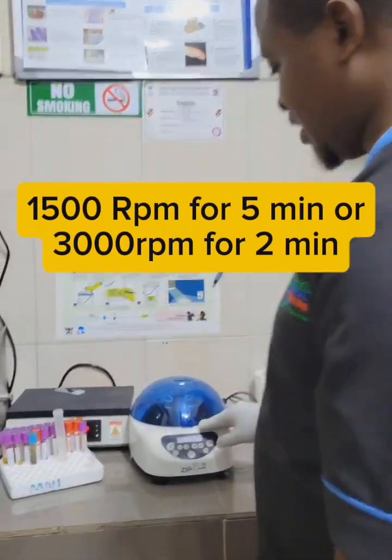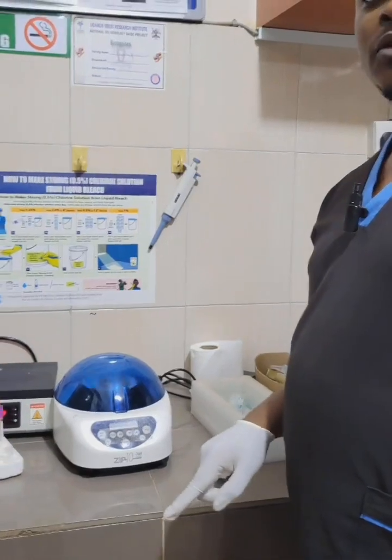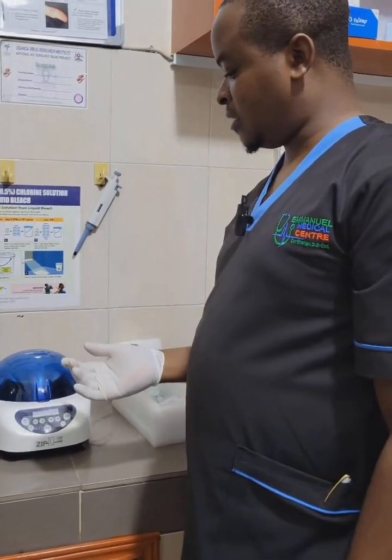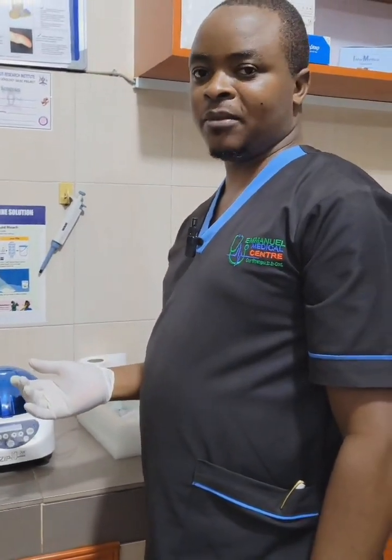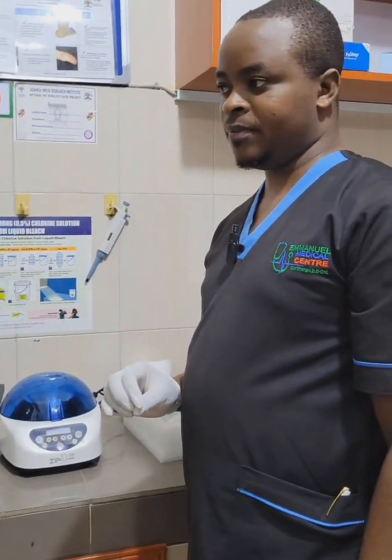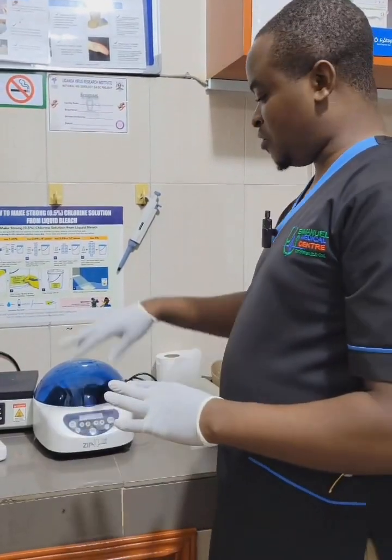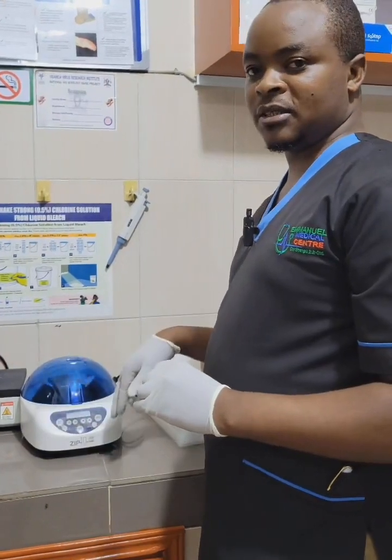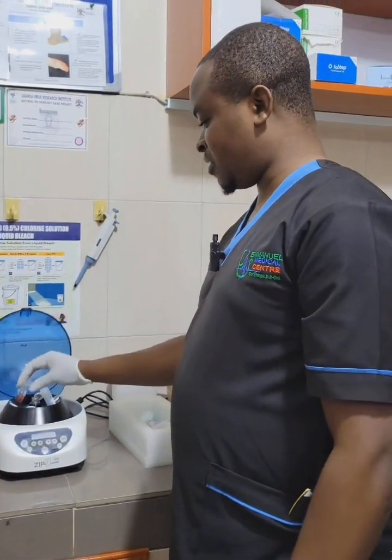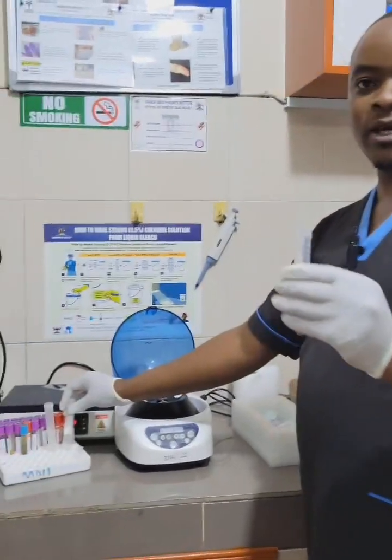So after setting our centrifuge, you start the centrifuge. Then you wait for the 5 minutes if you have used 1500 RPM, or 2 minutes if you have used 3000 RPM. Then after that, you leave the centrifuge to finish spinning. Then you open it and remove your sample, together with the one used for balancing.